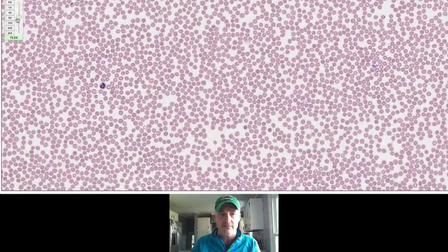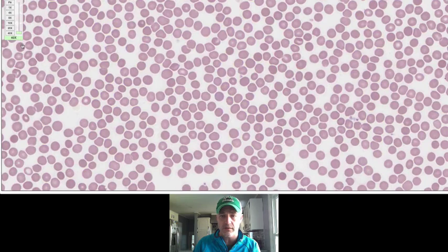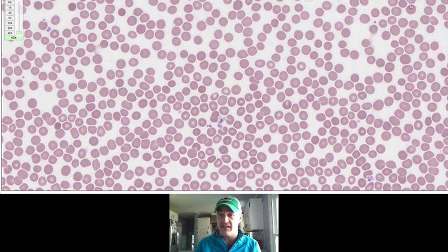As we're getting in here, you can see generally on a blood smear, you can see all over the place there's a lot of these red blood cells. Those, like I said, are quite easy to spot and quite easy to deal with. We're generally going to need to zoom in a little bit more. And then if you start looking around on some of this, you can see where the pointer is right here, a couple of those platelets here and there. And again, another platelet here, you can see red blood cells about everywhere.